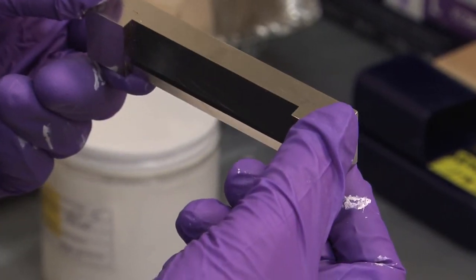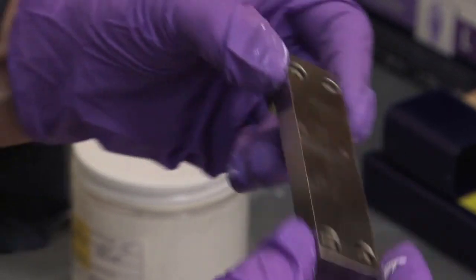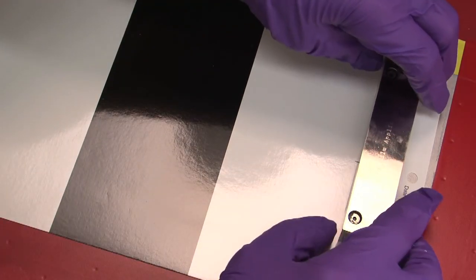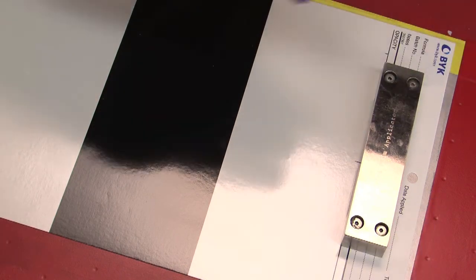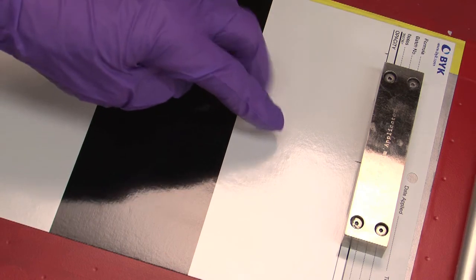To test opacity, we'll perform a drawdown using a bird film applicator with our automatic drawdown machine. We use drawdown panels patterned with black and white areas to see if the paint is capable of hiding them.